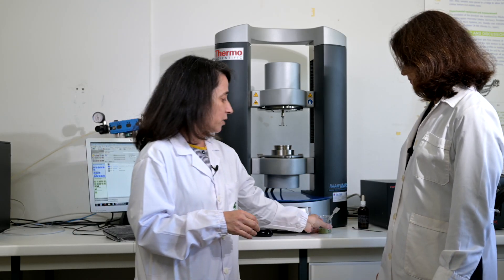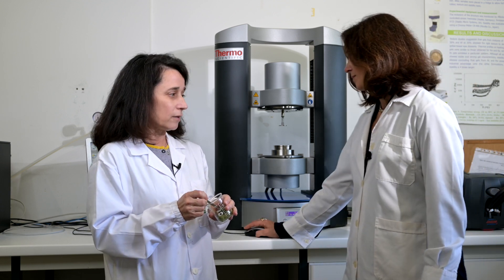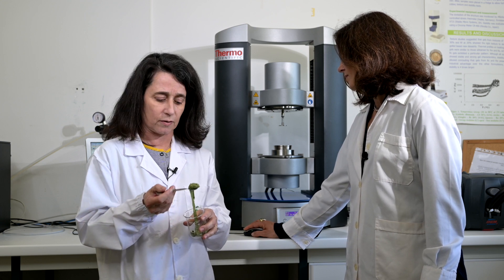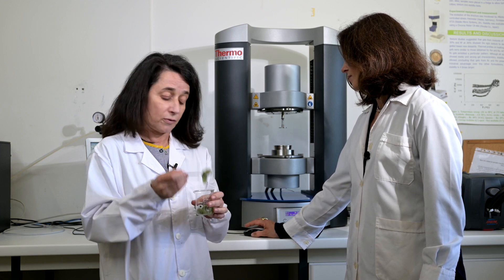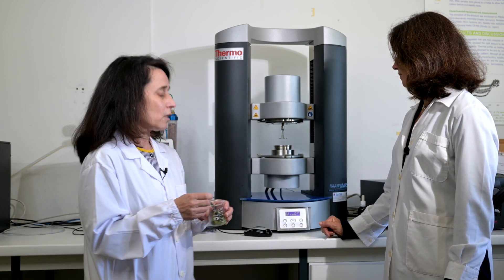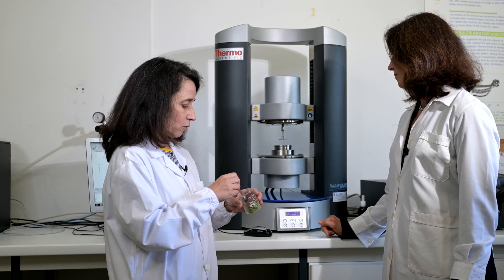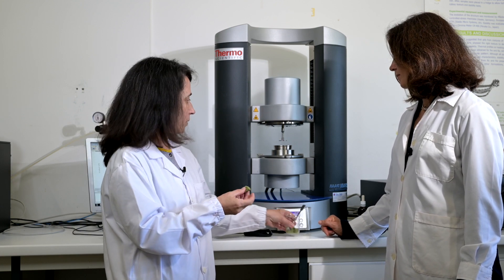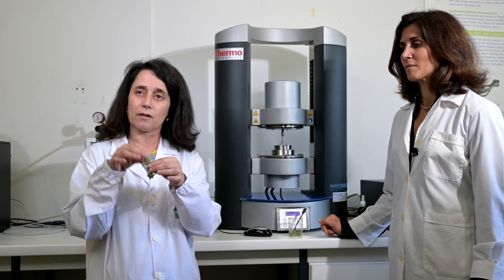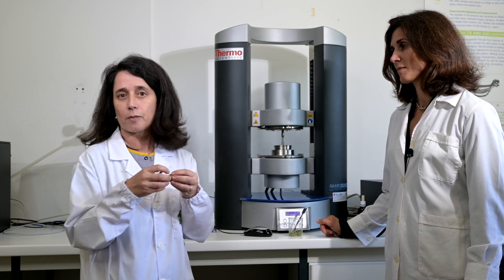Here we have our dough — this is a bread dough — and we are going to measure the linear viscoelastic region for this type of bread dough. This is related, as I explained, with texture, and we can measure the viscoelastic properties instrumentally with this type of instrument.